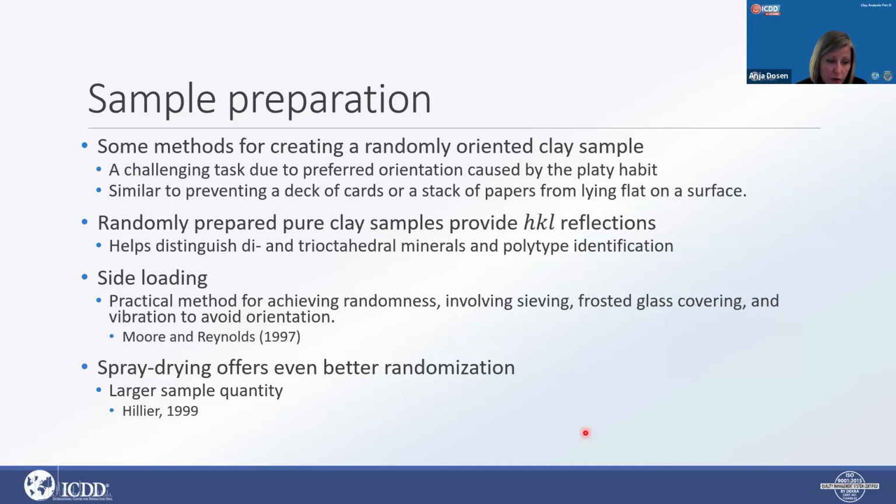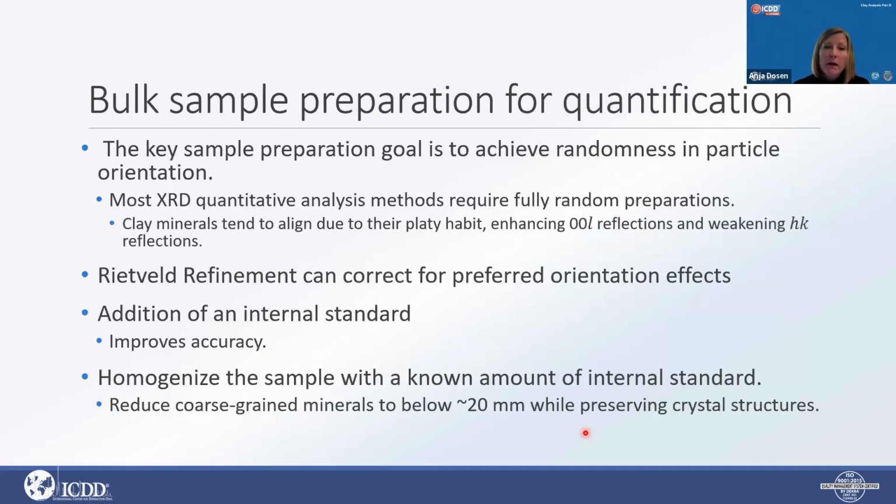Another option is spray drying that offers a really good randomization. For that, you prefer to have a lot of sample, and it is a very useful method as well.